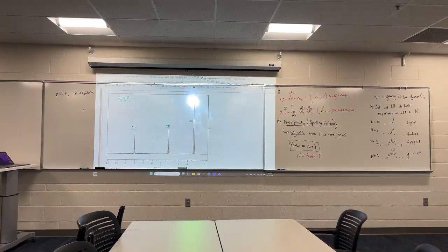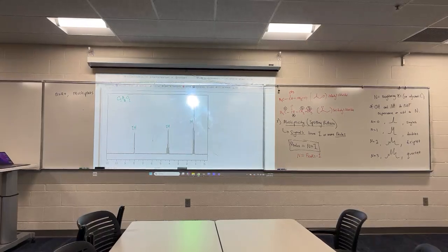Don't second guess yourselves. Remember to squint and shake your head if things don't look like they're in the right spot. I think you got too many carbons there, didn't you? Oh, no, you don't. Sorry, I didn't see that it was an OH group. This looks to me like you've got 3 1H groups and 1 CH3 group on the left. Do you agree? 1H, 1H, 1H. And this is just a 3H with only 1H next to it, which would be a doublet 3H and not a triplet. You agree? Okay.